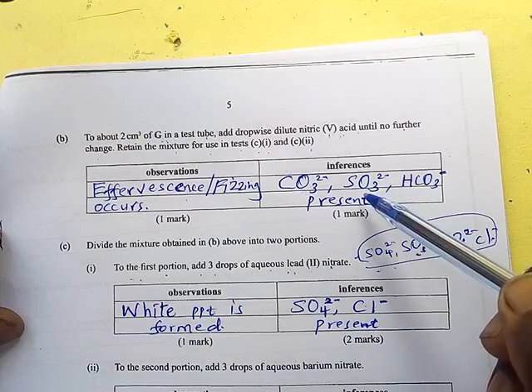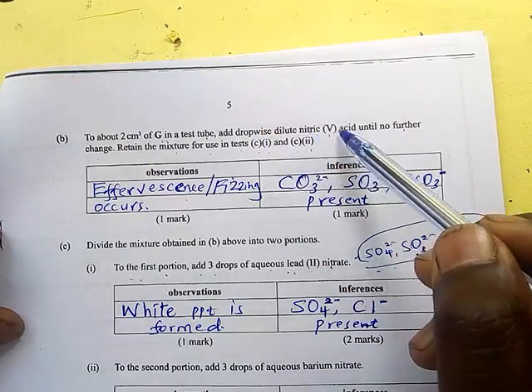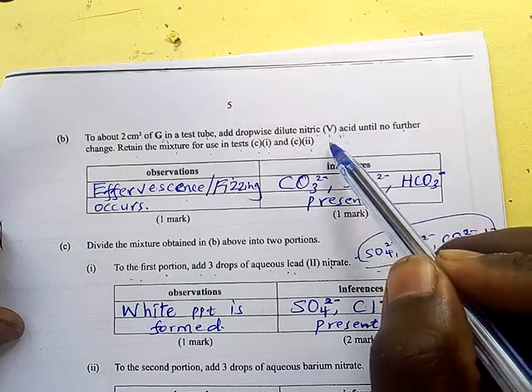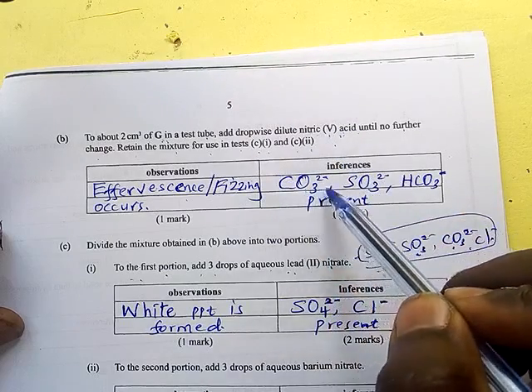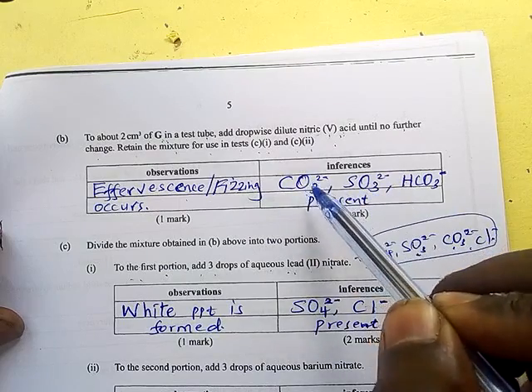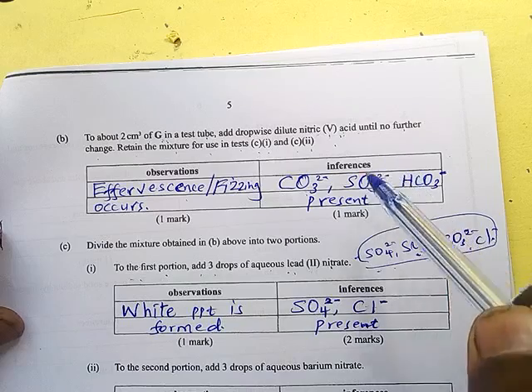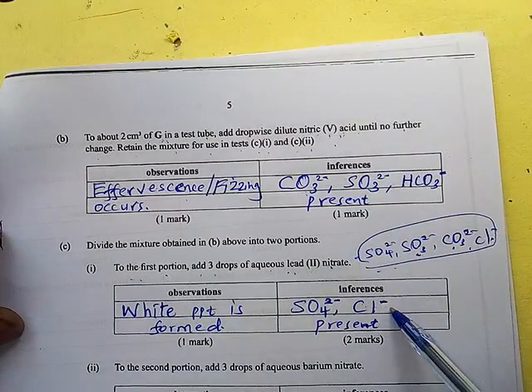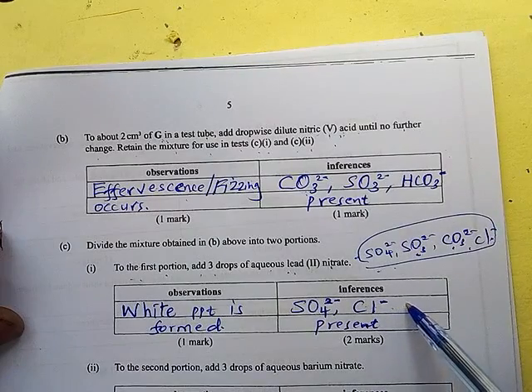Did you get what I've said? After adding nitric acid in solution G, the acid was in excess. It means the acid reacted with the carbonate and the sulfite completely, and there was no more carbonate and sulfite remaining inside there. Therefore, if you include them here, you will get 0.